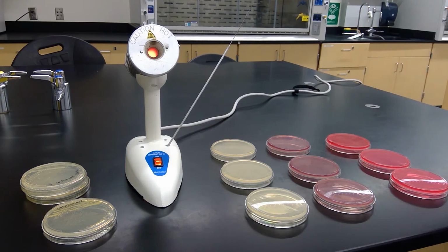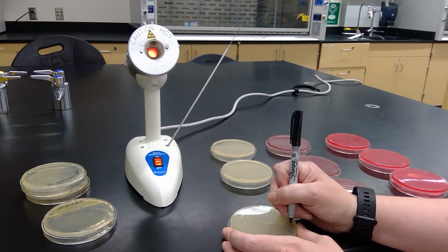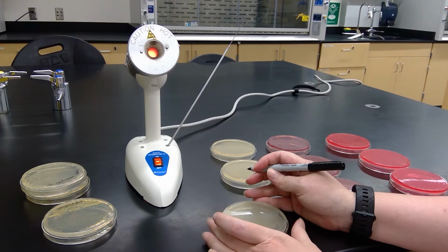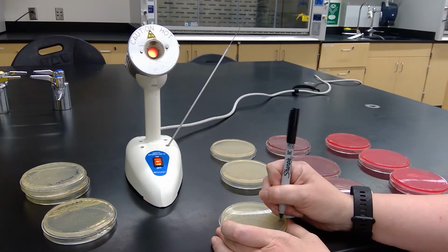All right, so I'll start with staph epidermidis. And the date.